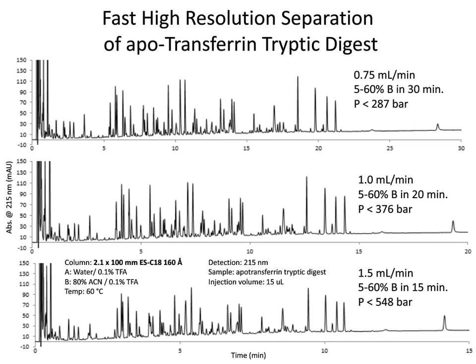So even though we are operating at nearly tenfold above so-called typical conditions, we still maintain considerable ability to resolve a sample. This is often overlooked for people who have used superficially porous materials, that because the dependence on flow rate is more decoupled from column efficiency, that fast separations can be conducted for complex samples.